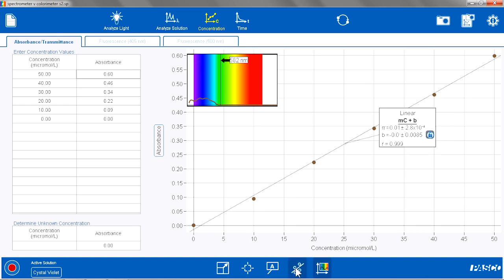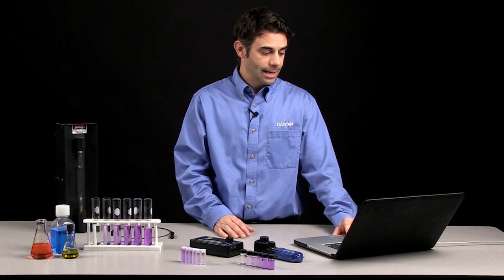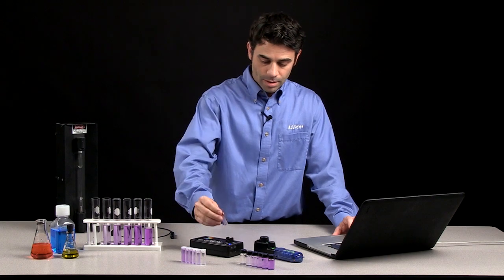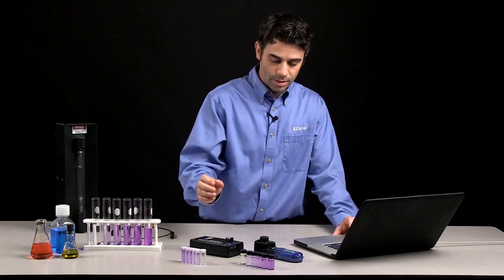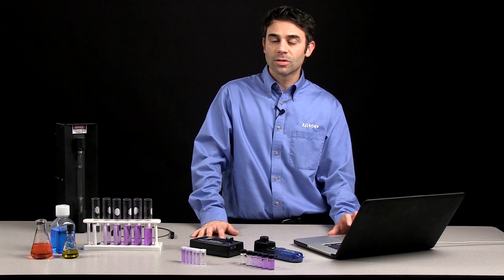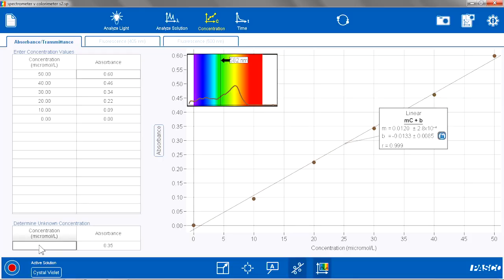And the other nice thing about the spectrometry software is I can take an unknown sample, and that unknown analysis is built right into this page. So I can insert my unknown, start my data collection, and save my data. And then the students can, based on the graph or their fit line or the slope and intercept, they can determine what the concentration should be.